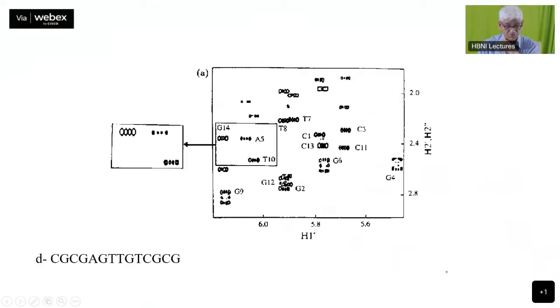In the constant time COSY, you saw this here. In this area, there was so much overlap of peaks. All this was overlapping. You could not figure out which nucleotides are present here. Here you can clearly see there are 2 nucleotide units present. You can identify them. They are slightly shifted, one from the other to the left. This can be clearly identified in the constant time COSY experiment. In the normal one, these were all overlapping together. In the E-COSY spectrum, one couldn't figure that out, but now here you can see them very clearly.